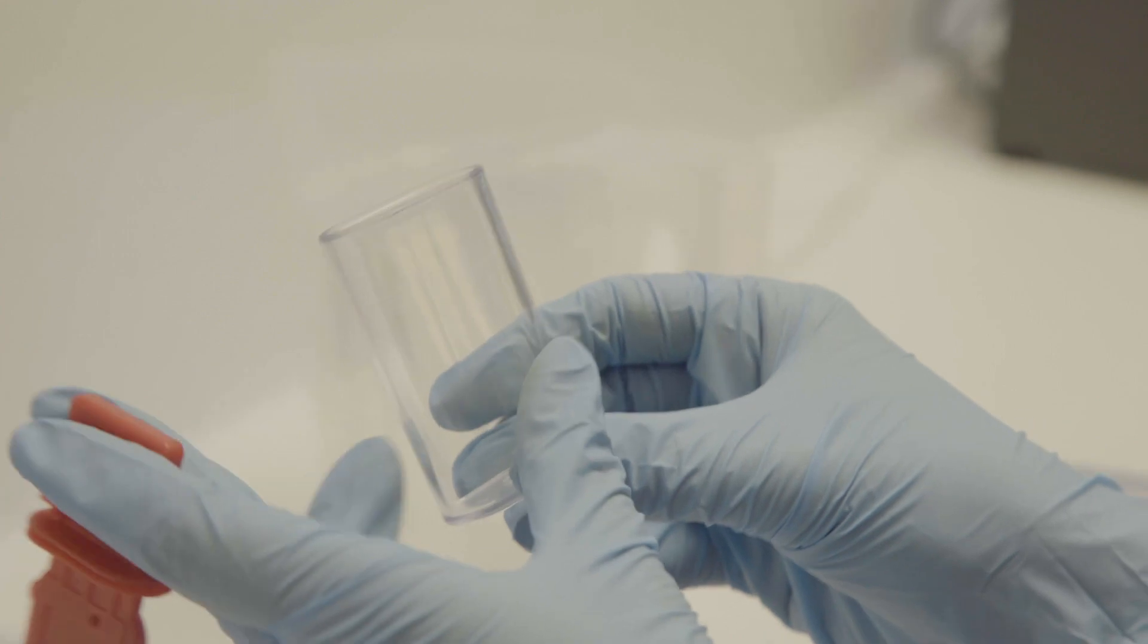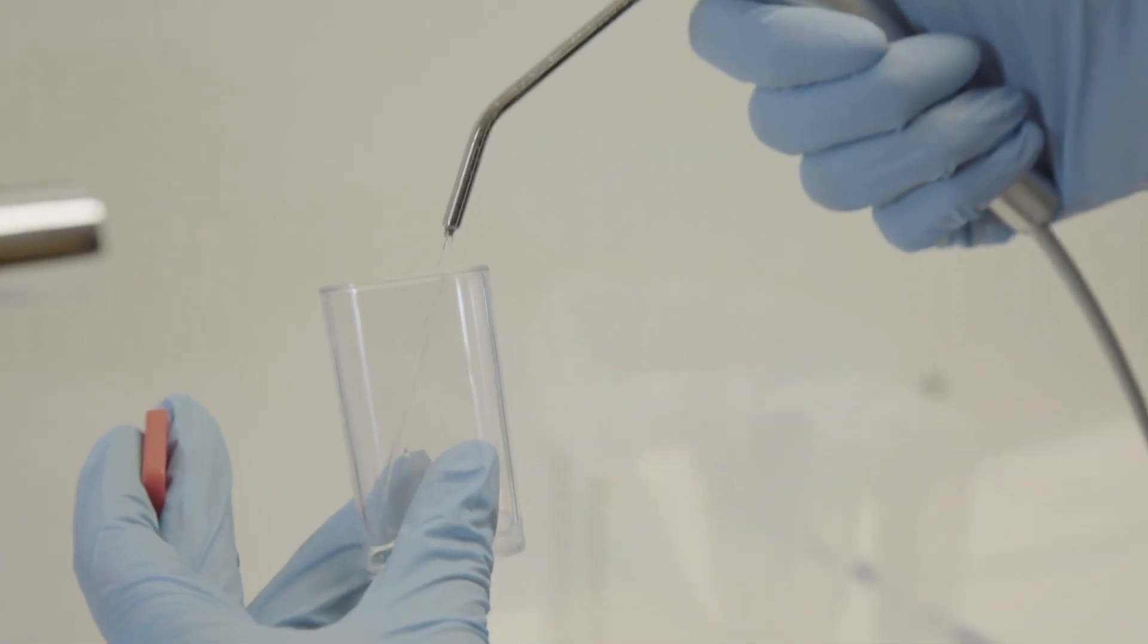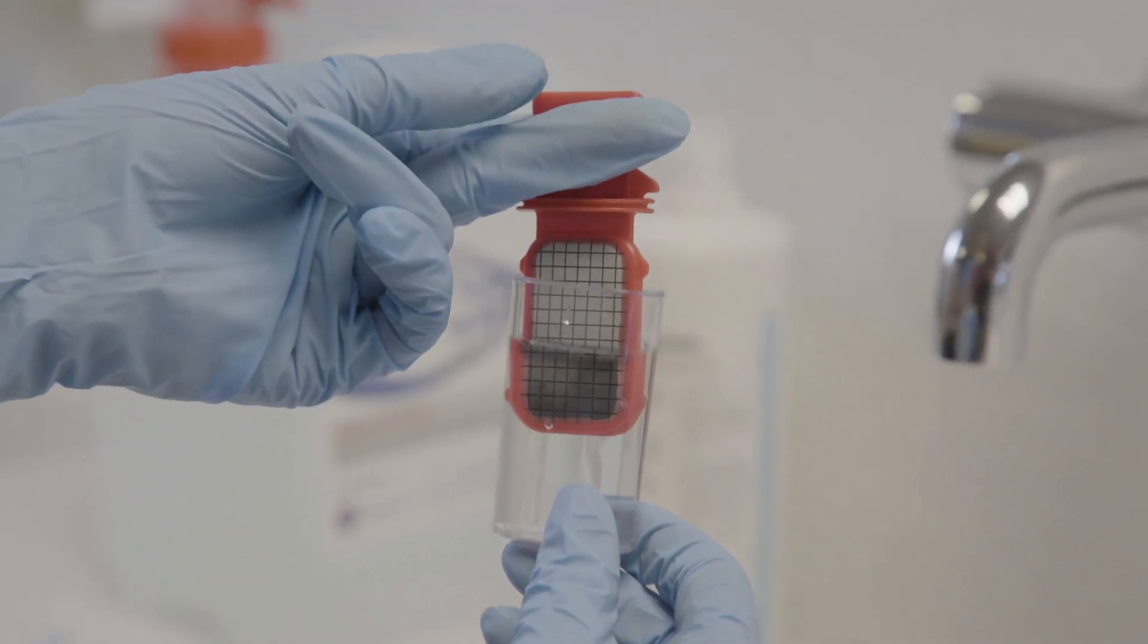Remove the paddle from the sample pot and fill to the 18mm mark from your 3-in-1 syringe. Place the paddle back into the pot and close securely.